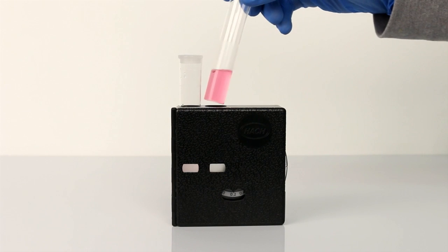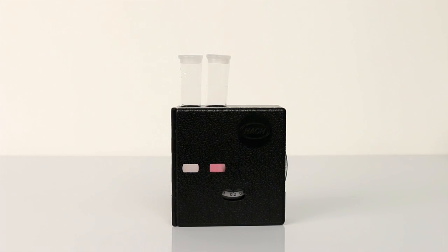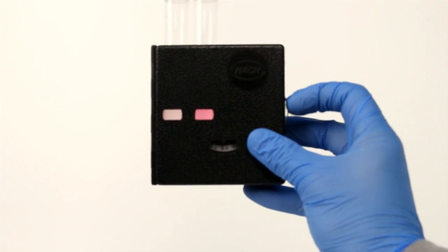Place the tube in the top right opening of the color comparator. Hold the comparator up to a light source while looking through the opening in the front.